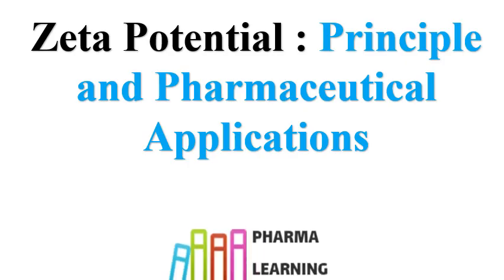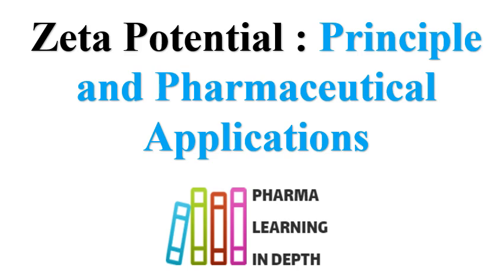So this is the information regarding the zeta potential. We should know and understand the zeta potential and its applications. Different formulations have different zeta potential requirements and these are required to be met. Zeta potential is a testing done in the pharmaceutical field for the formulations and complex drug delivery systems as it has impact onto the formulation stability, safety and efficacy.